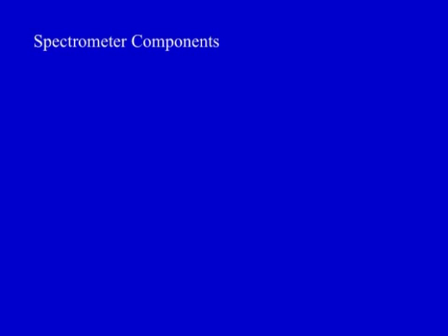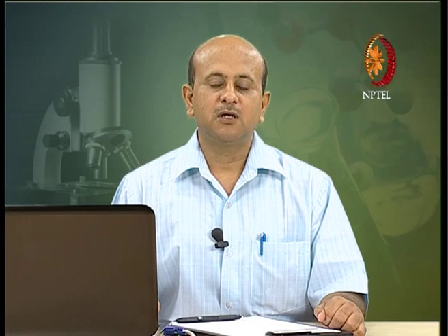Now, dispersive spectrometers were introduced in the mid 40s and were widely used. They provide the robust instrumentation required for the extensive application of this technique. If we take the IR spectrometer, it consists mainly of 3 basic components as in other spectrophotometers we have discussed earlier: a radiation source, a monochromator and a detector, and then a place for the sample to be put in.